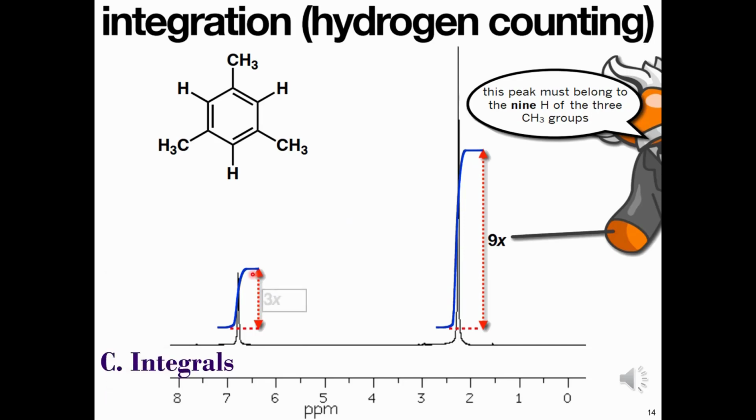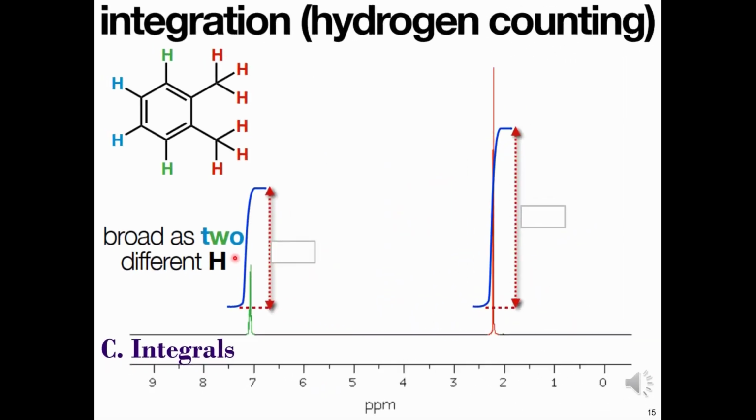There are 3 protons in this chemical environment as given by the integral, and these correspond to the 3 hydrogen atoms that are directly attached to the benzene ring. But is it always this straightforward for molecules involving a benzene ring? How many signals would you be expecting here? You'd be right for thinking 3.